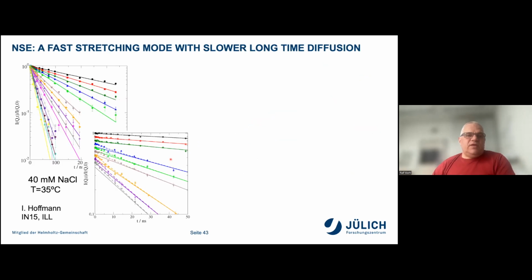Now from this, we look at spin echo data again. This picture shows the overall data, where in this region we see mainly translational diffusion that looks in this plot like a linear decaying function. If we look now at the short time region shown here, there we see again this fast decay on a 10 nanosecond time scale with amplitudes. Here we want to extract again these amplitudes.